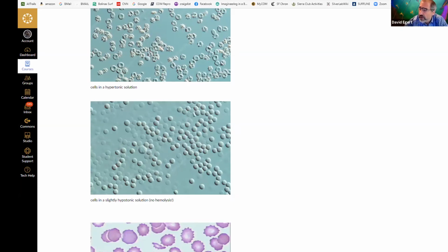Slightly hypotonic meaning they've inflated, but they haven't inflated too much, because what would this look like if this was test tube 1 or test tube 2 or the urea or the ammonium chloride? What would I see in the microscope? You wouldn't see cells. They would be little fragments. I wouldn't see much of anything. If anything, I would see maybe little bits of schmutz floating around. But in general, the cells have exploded and shredded. There's not really much to see at all.